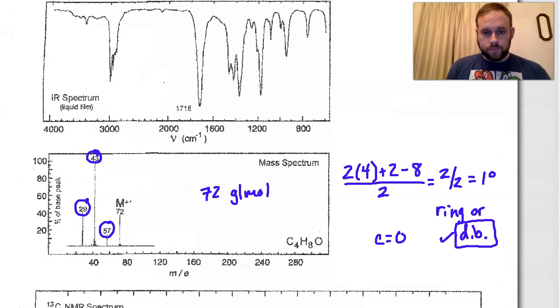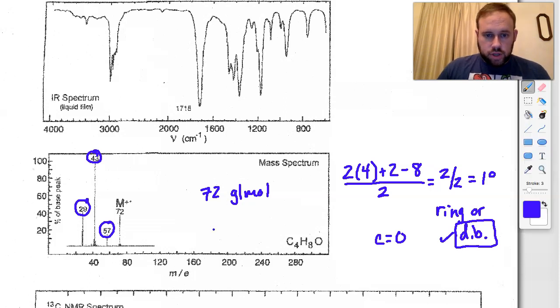All right, so what we can predict is that we most likely have some sort of a 4-membered chain, so some sort of a butyl, and then somewhere in there one of the carbons is probably going to be double bonded to an oxygen. But let's confirm that by going through and looking at the other specs. So moving on to IR, which is our normal pattern, we can see that there is nothing north of the 3000 inverse centimeter or wave number region.